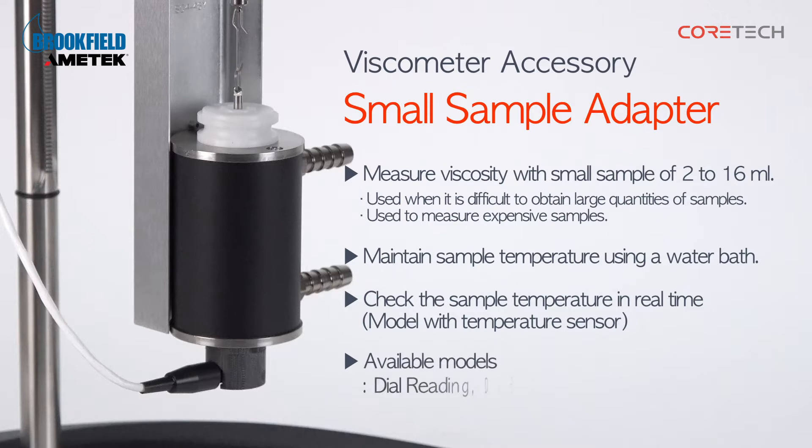The small sample adapter can be mounted on Brookfield Dial Reading, DVE, DV1M, DV2T, and DV3T viscometers.